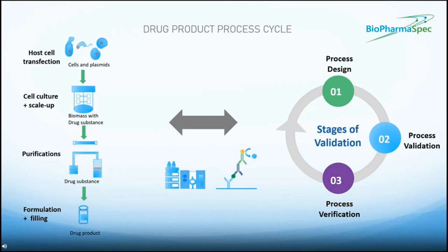During manufacturing, the different stages of validation continually cycle between identification of process variables or critical parameters, defining control strategies, monitoring, and then making appropriate improvements where necessary. And what we know is that process-related impurities like HCPs are highly dependent on the process and the controls that are applied. So for any given product and process, it's important to continue to monitor the stages for any changes that can impact the HCPs detected, and to do it in a timely manner, because of course what's suitable for one product may not be suitable for others, even using the same manufacturing platform.